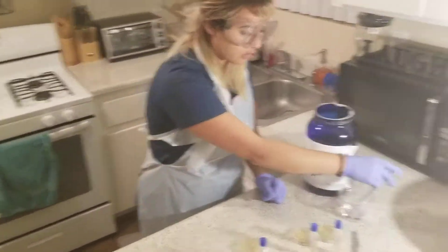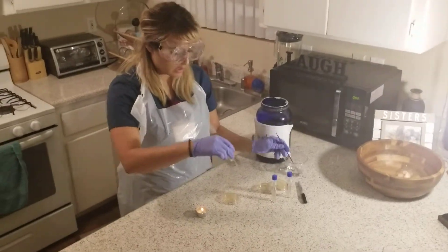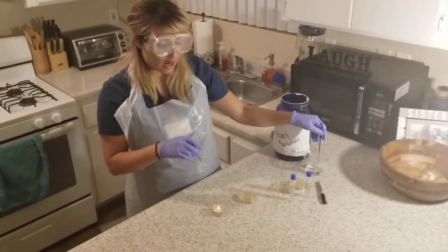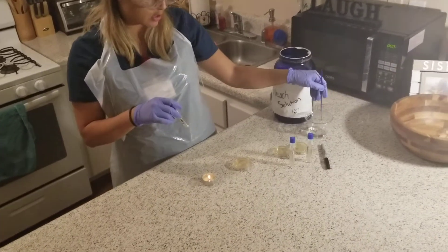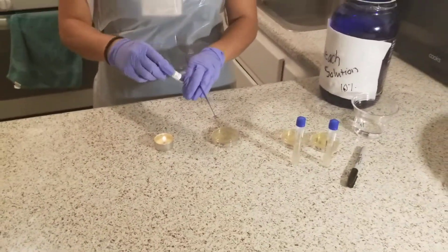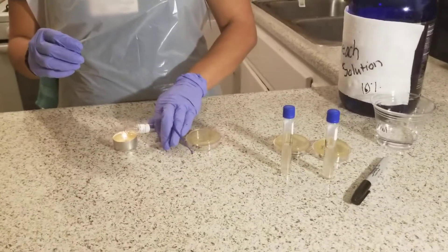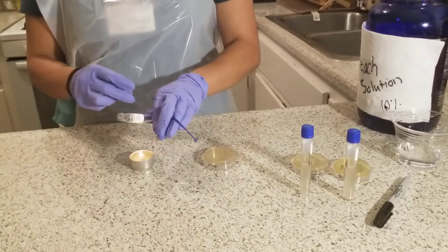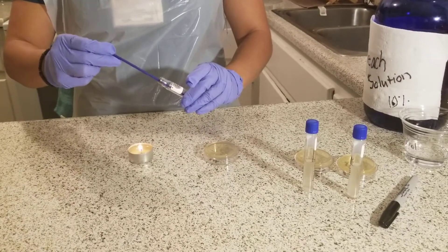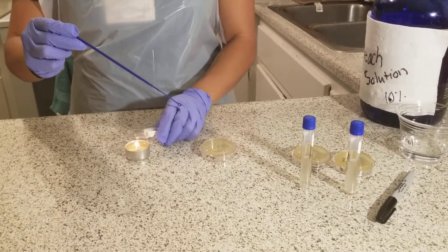First you have your inoculating loop, which is this tool right here. To use the aseptic technique, you want to make sure that the loop is dry of the alcohol — this is just for no contamination. What you're going to do for the broth is first make sure it's sterile by waving the lid or the top of the tube over the flame. Then I will put my inoculating loop into the culturing broth and then flame again to keep it sterile, no contamination.